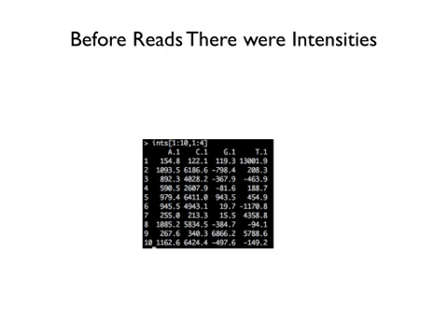It's very close. So when you get the read, it doesn't necessarily let you know that. It does have the quality as a way to tell you. There's one number that comes with each base, and another number that tells you how sure they are about it. We're going to go back to this data. It's very hard to get if you're interested in working on this, but it is possible to get.